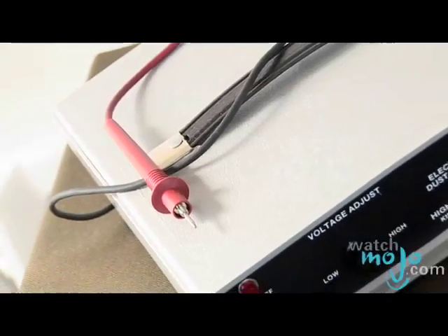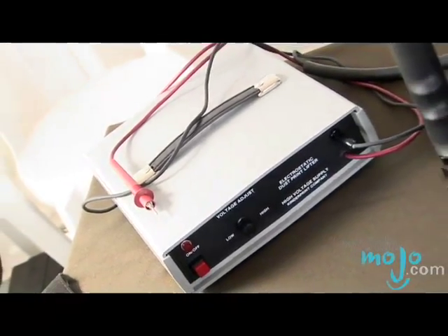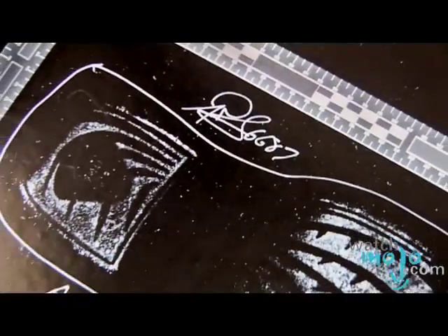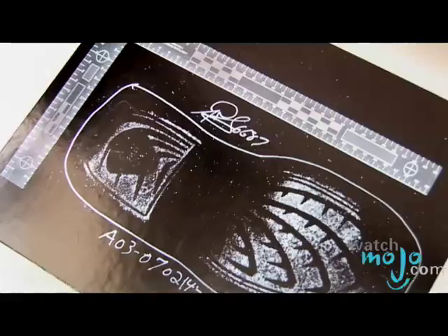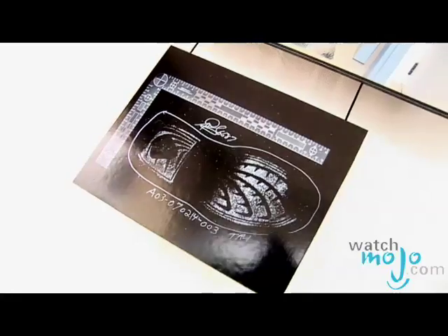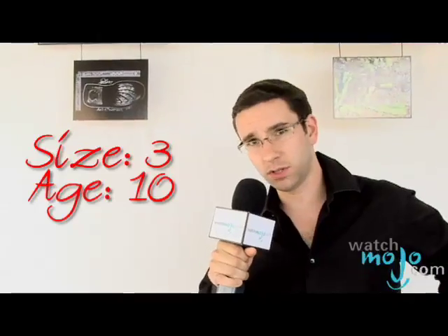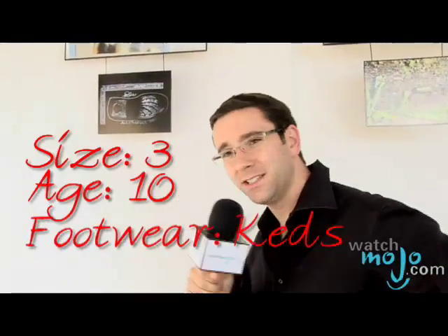Afterwards, we have an electrical machine to find your footprints at the scene of the crime. It's a negative and positive connection that raises the little pieces of dust on the ground to such an extent that they can actually zoom in on it and see what the footprint of that person's shoe was at the scene of the crime. So basically that guy was wearing a size 3, must have been about 10 years old. Looks like a Keds shoe possibly, maybe a sandal, I'm not sure.